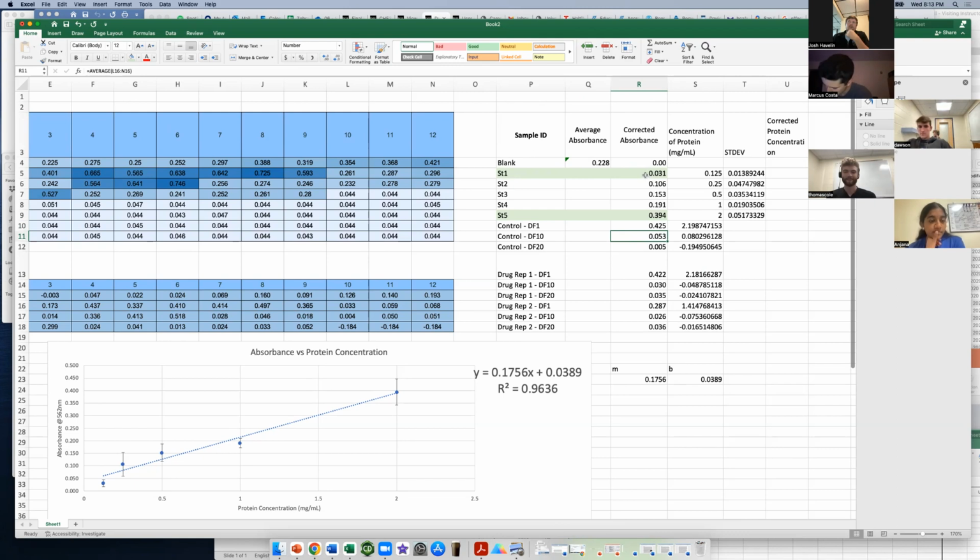All right. So what I'm going to do, if you guys need feedback on this, just get my feedback on this. I'm going to remove the lowest value from this curve, which is going to change this information. So this changes a little bit, 6.2, but hopefully this fixes things.